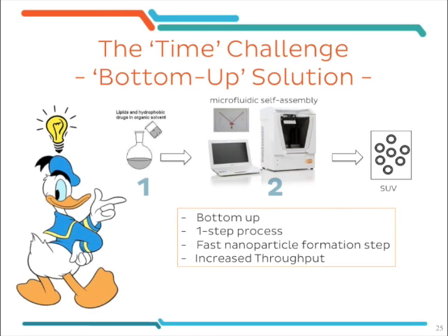And this is possible through nanoprecipitation, but the trick here is to do this in a microfluidic channel, as we determined earlier. Here we have control over how the lipids self-assemble into liposomes and nanoparticles. So essentially, if we use a controlled nanoprecipitation technique, we can make liposomes or other nanoparticles of a defined size within 2 short steps. The first one would be dissolving the lipids in the organic solvent, and then the second step, we would perform the nanoprecipitation in the microfluidic chip, which takes less than a minute.